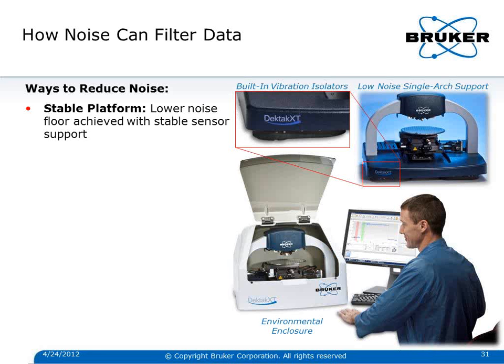If you have a cantilevered arm that's hanging out over a long area and there's vibration, that cantilever actually acts as a diving board and exacerbates the noise. So you need a very stable platform to support your sensor head for your measurements.